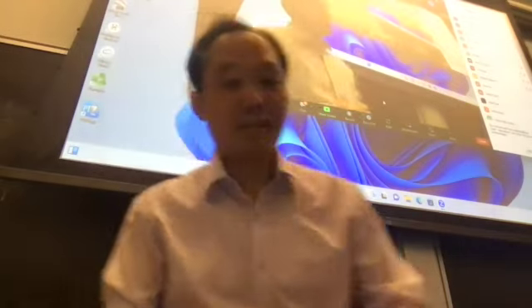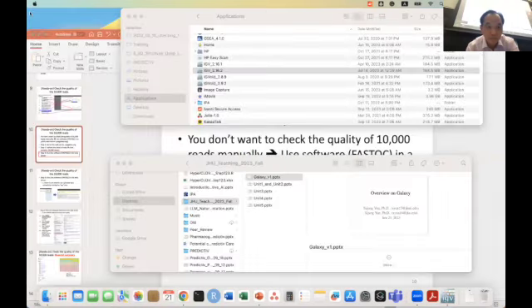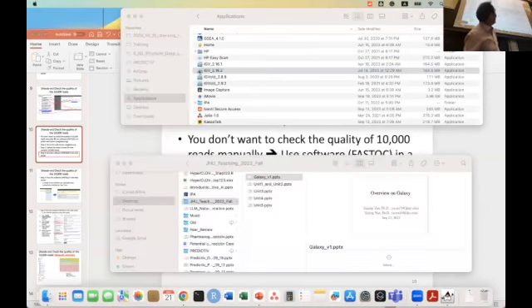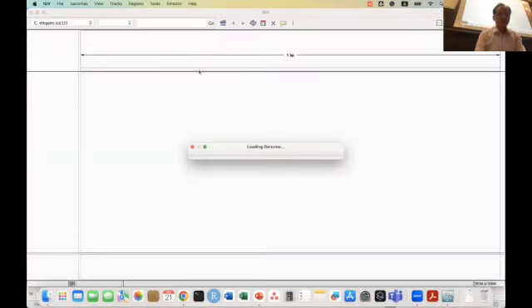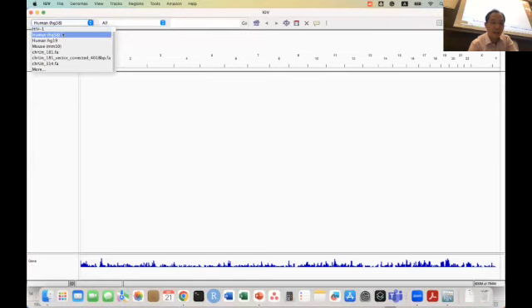Oh no, sorry, why not? Sorry for that. Let me do it again. Okay, so IGV version. Oh yeah, let's see. Yep. So this is the IGV genome browser, and please choose human HG38, human genome version 38.